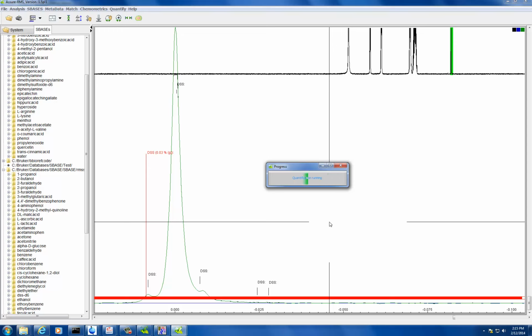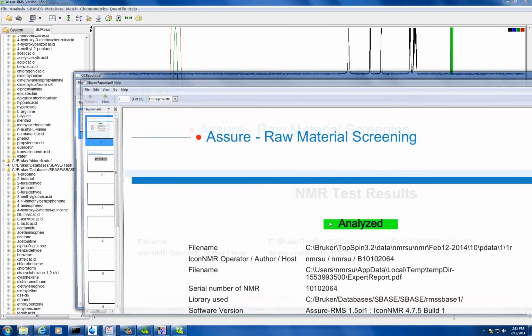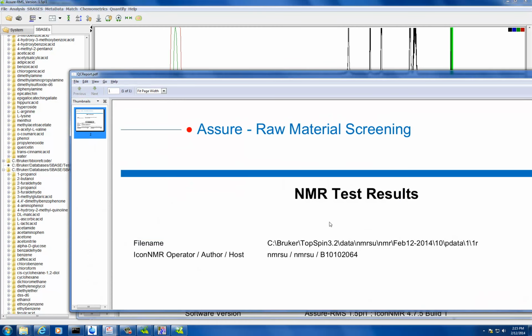Like the report that we got right now, the same kind of report will we be getting once you start quantifying? Yeah, it'll always be the same report. At the same time, that folder with the spectrum will also have an Excel file of all the quantification numbers. So it contains a PDF and an Excel file. So let's see for this one here. So usually you keep seeing 2 reports come out, and the reason why, again, this is for industry. For the QC report, if you have a technician just running samples, they really don't need to see the summary of that sample. So they have a QC report just saying that it ran, that it was fine.